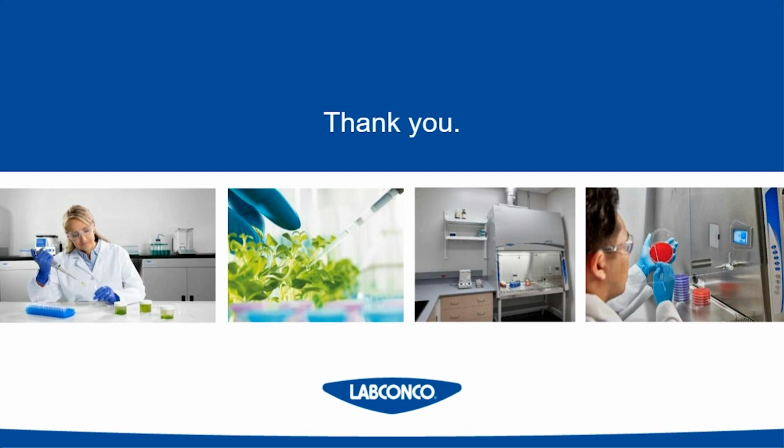The A/B3 cabinet has been replaced by the Class II Type A2 cabinet currently. So if you're looking at replacing an old A/B3, your direct replacement on today's marketplace would be the Class II A2. Wonderful, thank you.